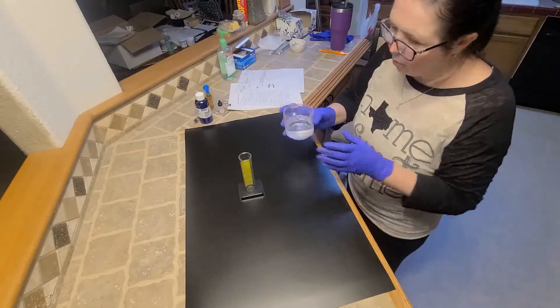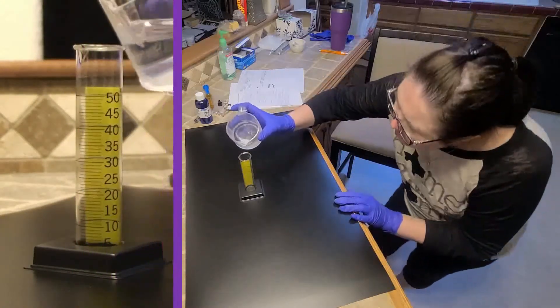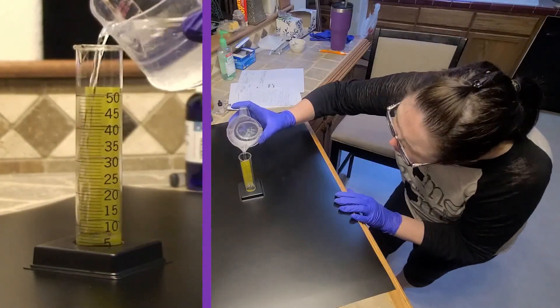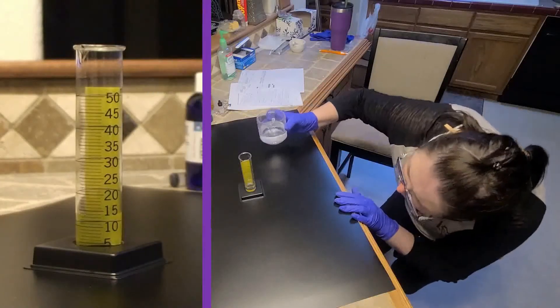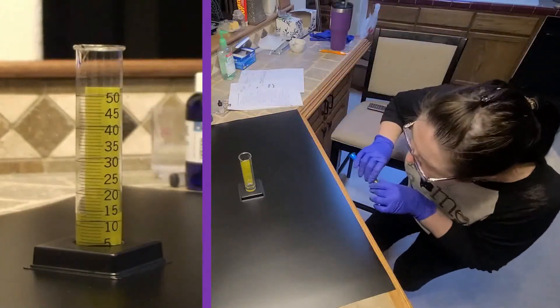So we're adding 14.7 milliliters of distilled water.